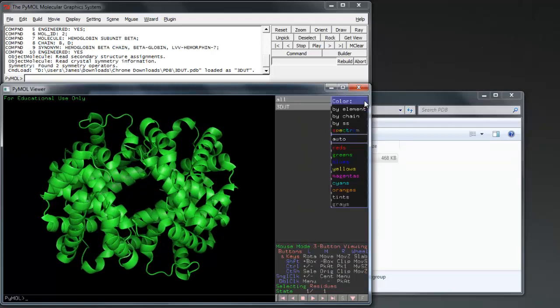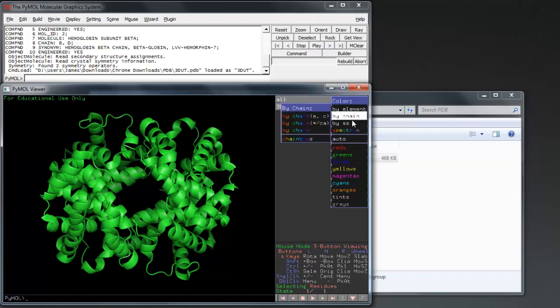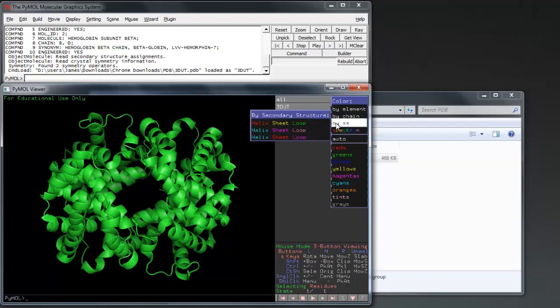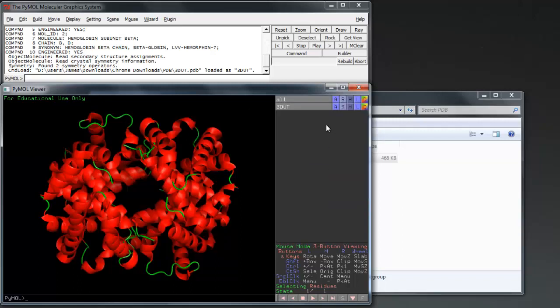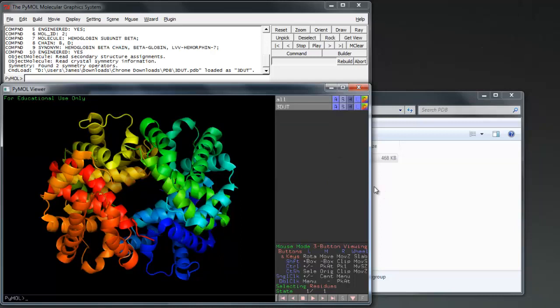There are a number of different ways we can color our protein, such as by elements or assigning different structures different colors. Here I color the protein by spectrum rainbow, helping define the different subunits of the hemoglobin.